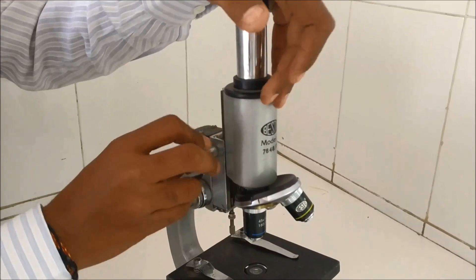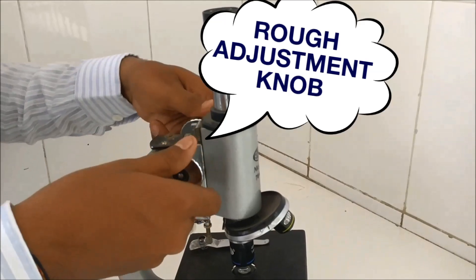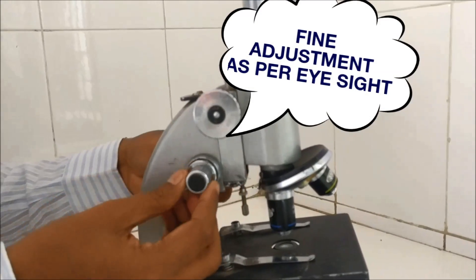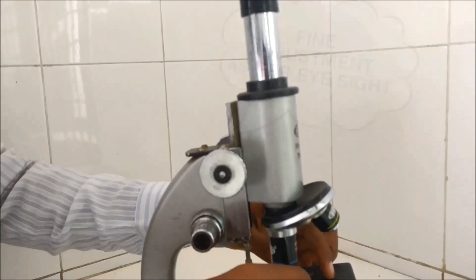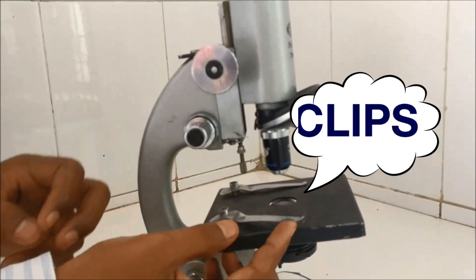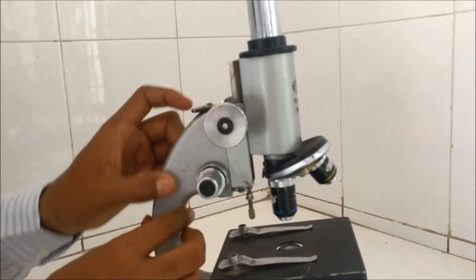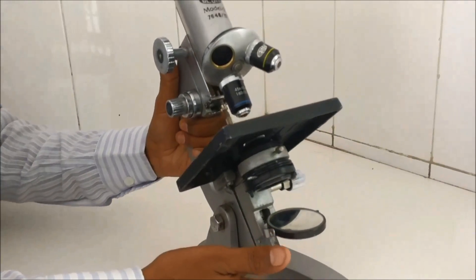There is a knob called the rough adjustment knob, which is used to move the body tube up and down for focusing the slide. Sometimes eyesight varies between students, so they use the fine adjustment knob — a smaller knob below the rough adjustment. There is also a clip meant to hold the slide on the stage.